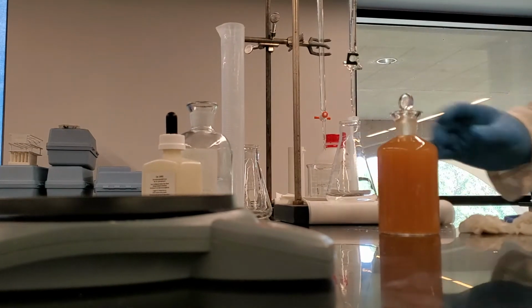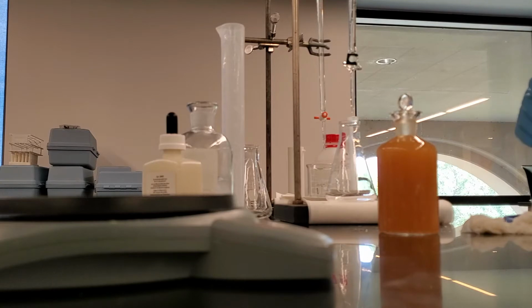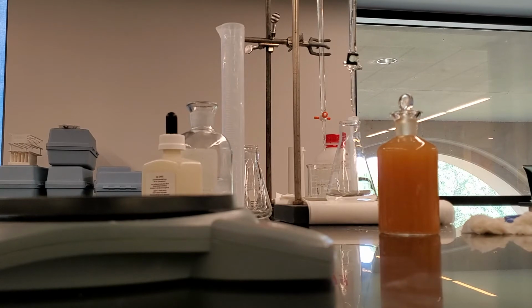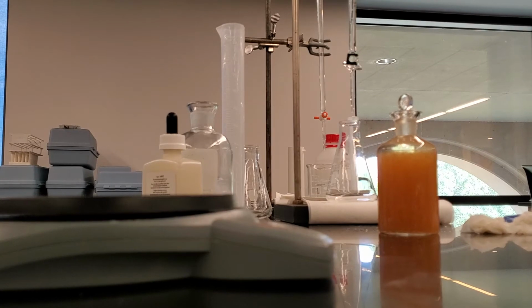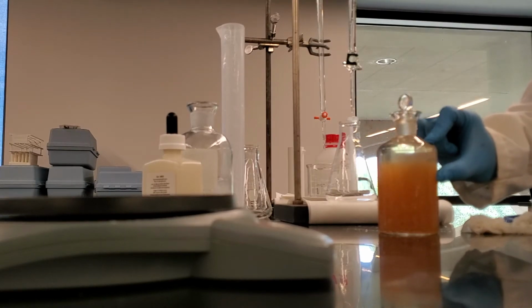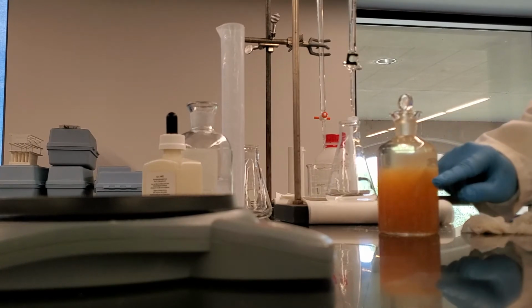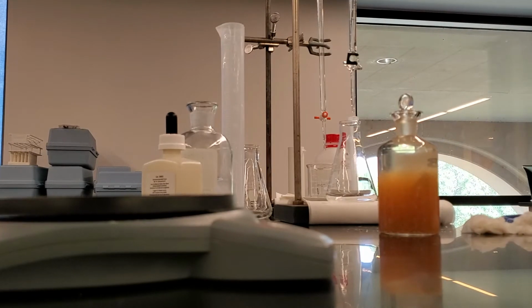I'm going to let it sit for a while to allow the precipitate to settle down and form a clear liquid at the top. So this whole bottle is 300 milliliters. So if I have about 1/3 of clear liquid, that will be about 100 milliliters of clear supernatant. I'm going to wait for the precipitate to settle down up here and then go to the next step.